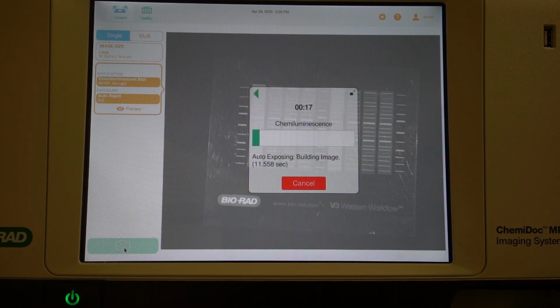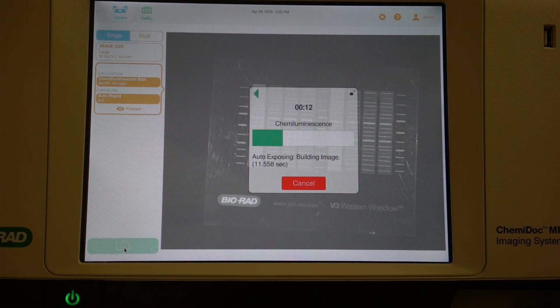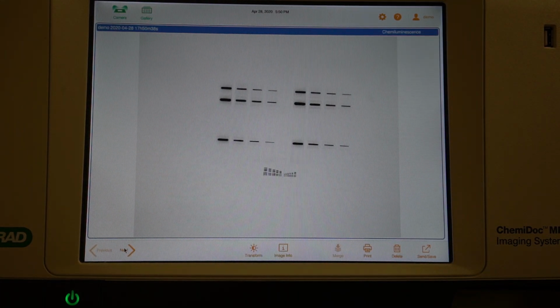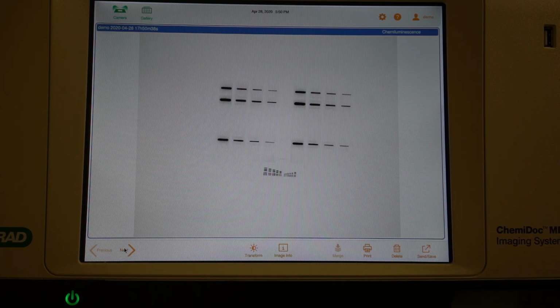If you find at the bottom there is an exclamation point, that means that you have the wrong tray selected for your specific application that you want to do. So it won't allow you to take a picture if you're using the wrong tray, which is a great safety check. So as you can see, once the imager takes a picture, it takes you right into the gallery. It automatically saves your image so you don't have to worry about losing anything.